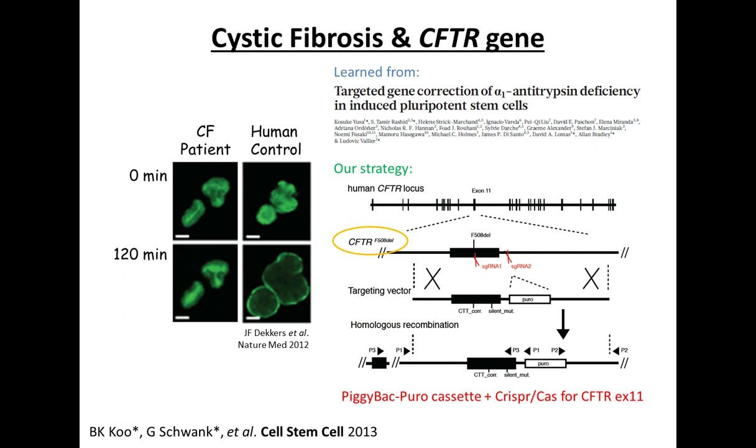So the main task that I had at the time was figuring out where in the CFTR we have a mutation, and designing a gRNA and the targeting vector with which we can cure the genetic scar to have the correct sequence. We found that the mutant organoid had a famous mutation, which is the phenylalanine deletion.